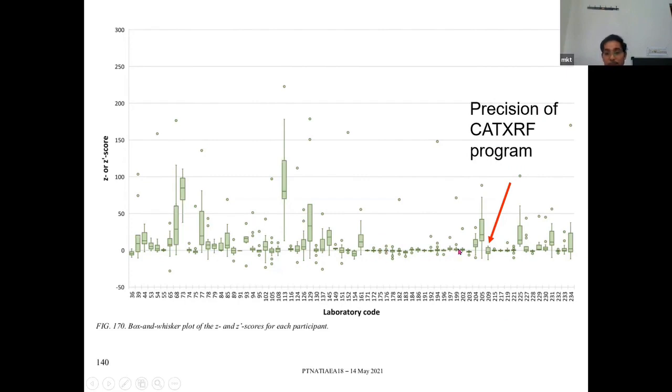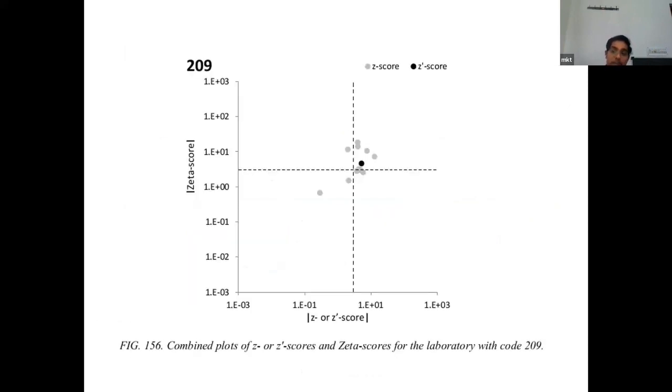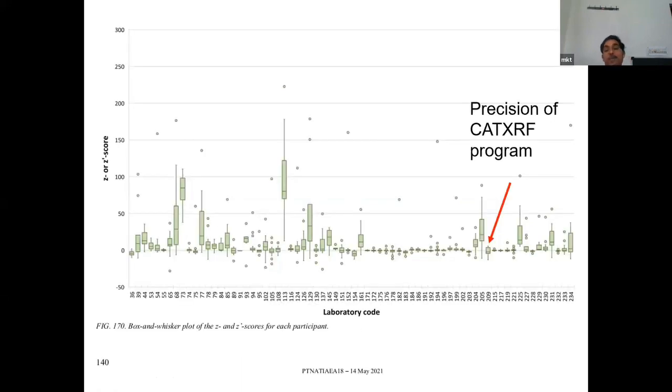Normally in this region people utilize neutron activation. For TXRF analysis, there is no problem with quantification; the peak area determination is the major point. If you want to precisely determine the peak area intensity and the spectrum fitting process is not good, you might have very high errors in quantification.